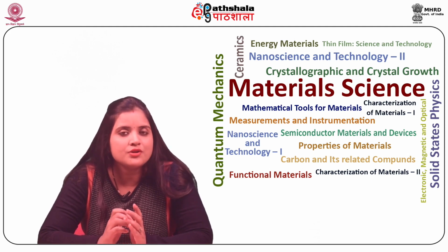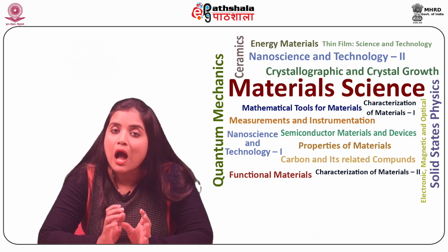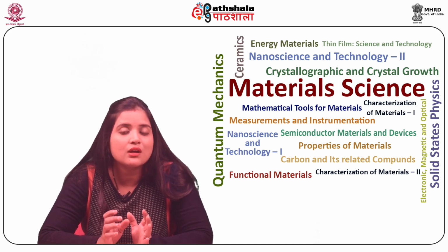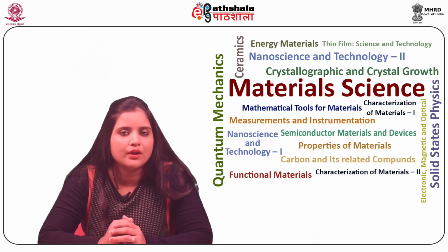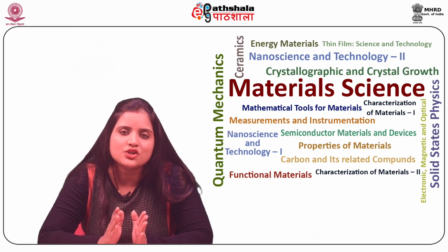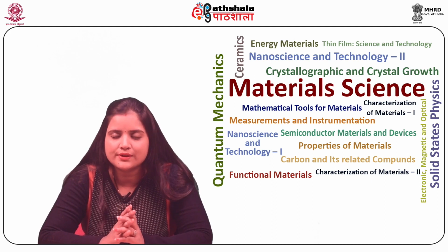SPM belongs to the branch of microscopy which produces high-definition images of a surface using physical probes that scan the sample. This is done by keeping the probe stationary and moving the sample or vice versa.